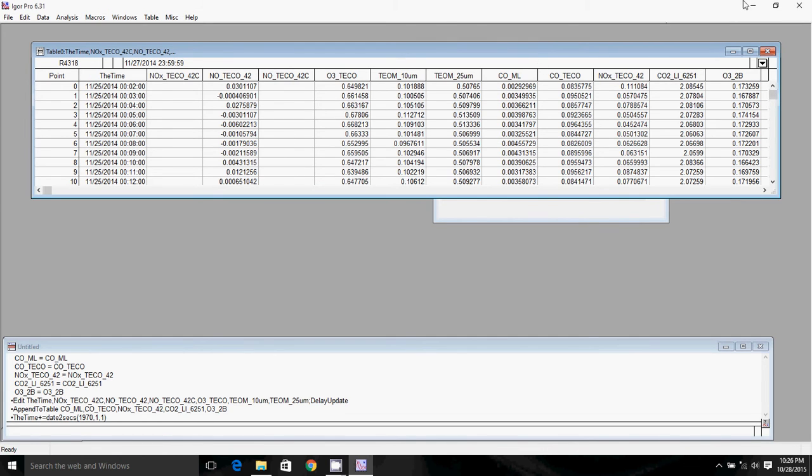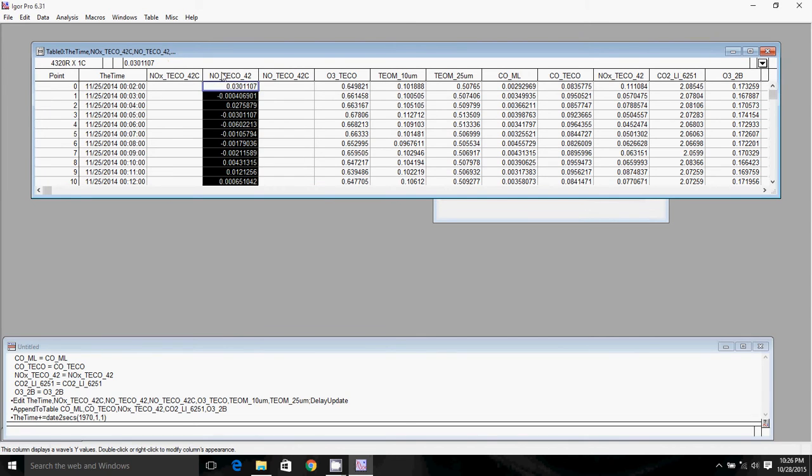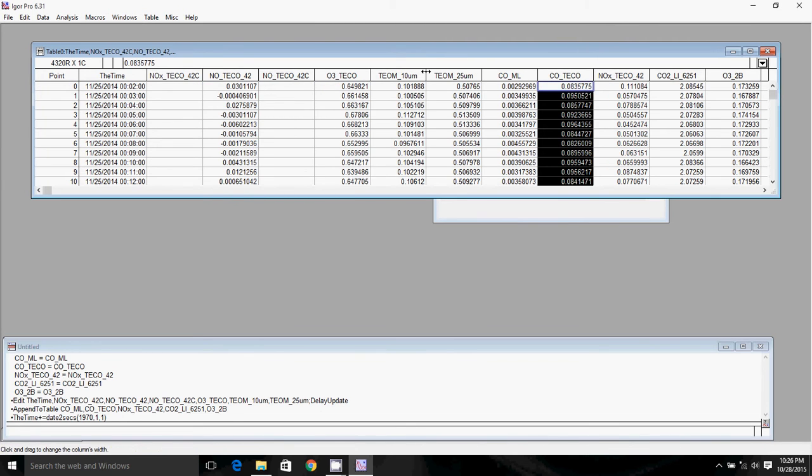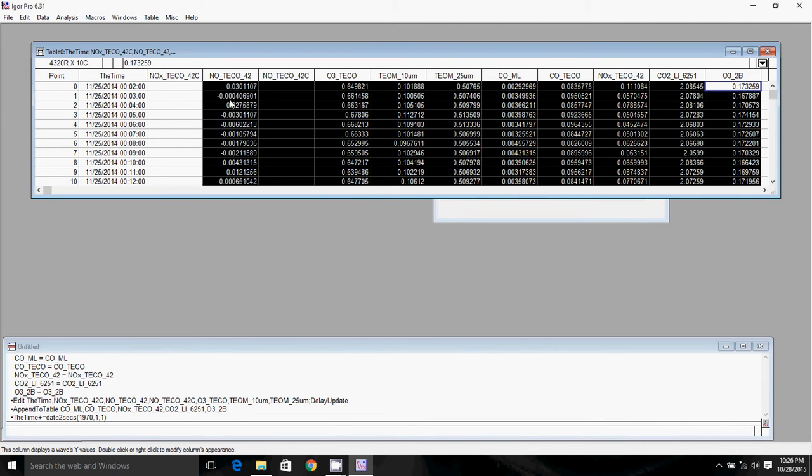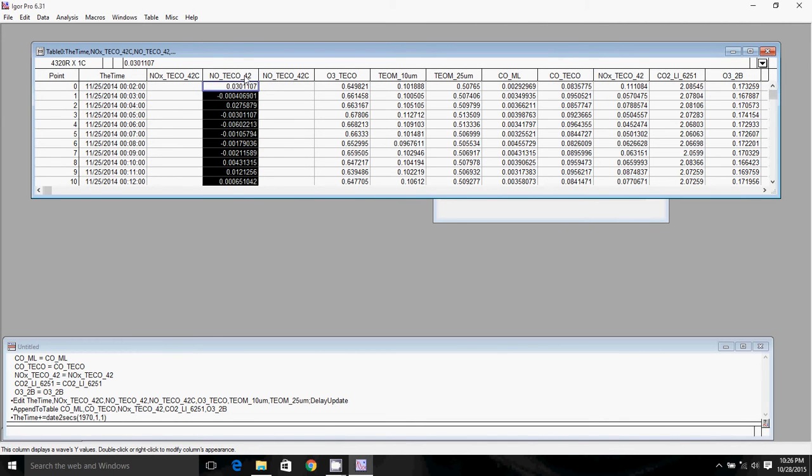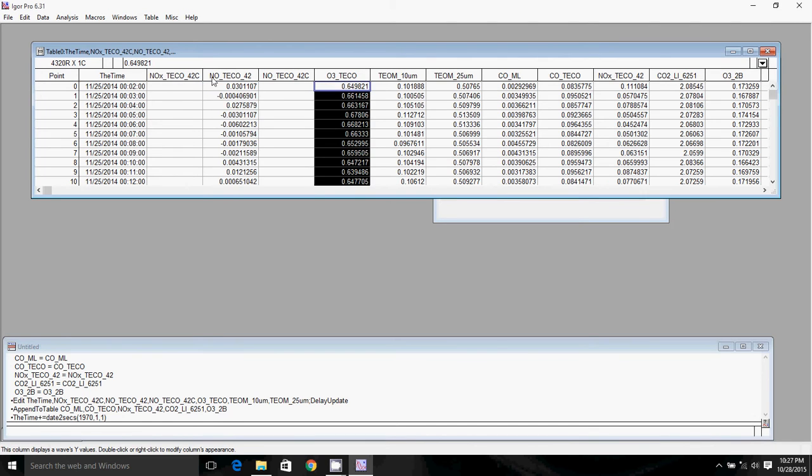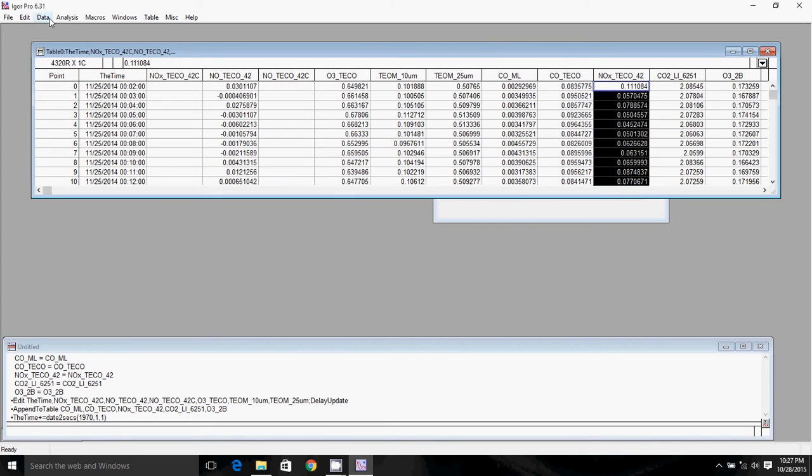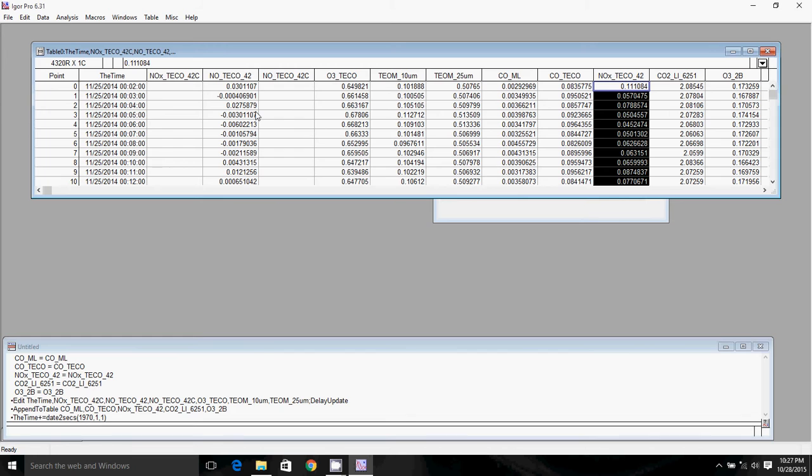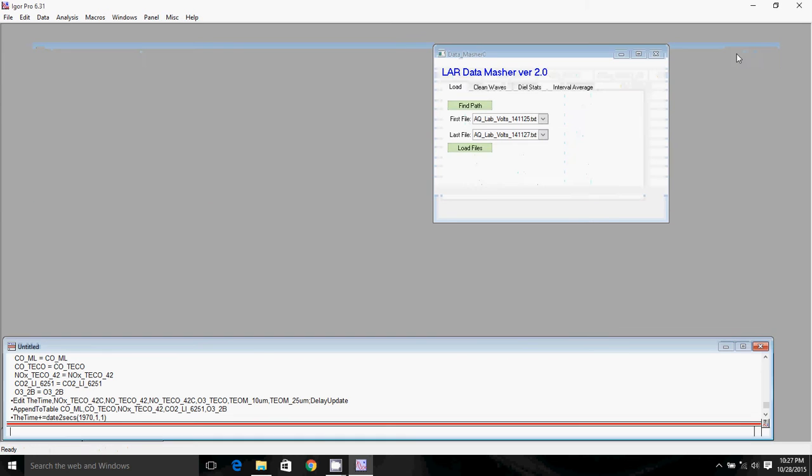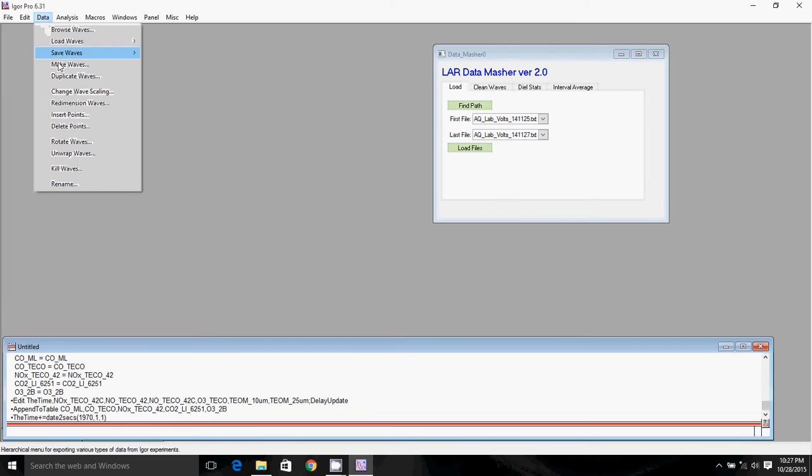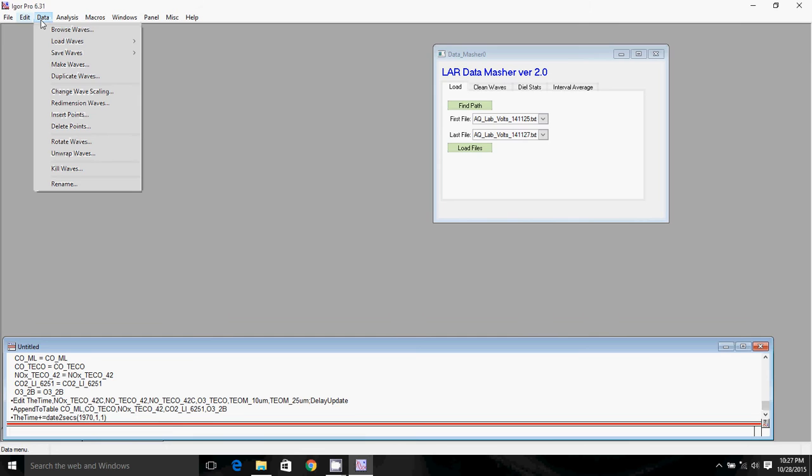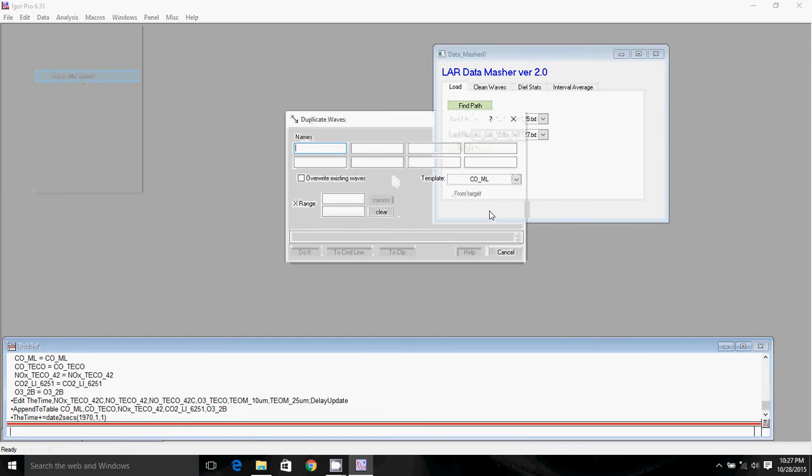So then the next thing we're going to want to do is convert our voltage readings, which we have here in our data file into parts per billion. So I'm not going to work on every single wave here. I'm going to work on the NO, Ozone, CO, and NOx. So what I'm going to do is duplicate all of those waves. We're going to want to leave these raw data waves in their purest form, just in case we make a mistake down the road. We want to have our raw data still available to us. So I'll just go ahead and minimize that table and get it out of the way. I will go ahead and duplicate those waves. So to do that, you click on the data tab, you click on duplicate waves.